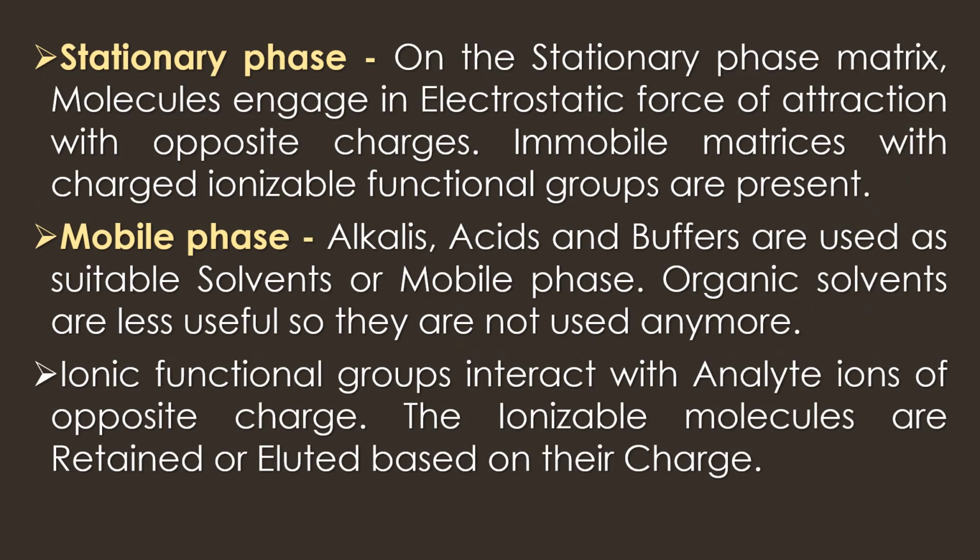On the stationary phase matrix, molecules engage in electrostatic force of attraction with opposite charges. Immobile matrices with charged ionizable functional groups are present in the stationary phase. Alkalis, acids, and buffers are used as suitable solvents or mobile phase. Organic solvents are less useful, so they are not used anymore. These ionic functional groups interact with analyte ions of opposite charge, and the ionizable molecules are retained or eluted based on their charge.